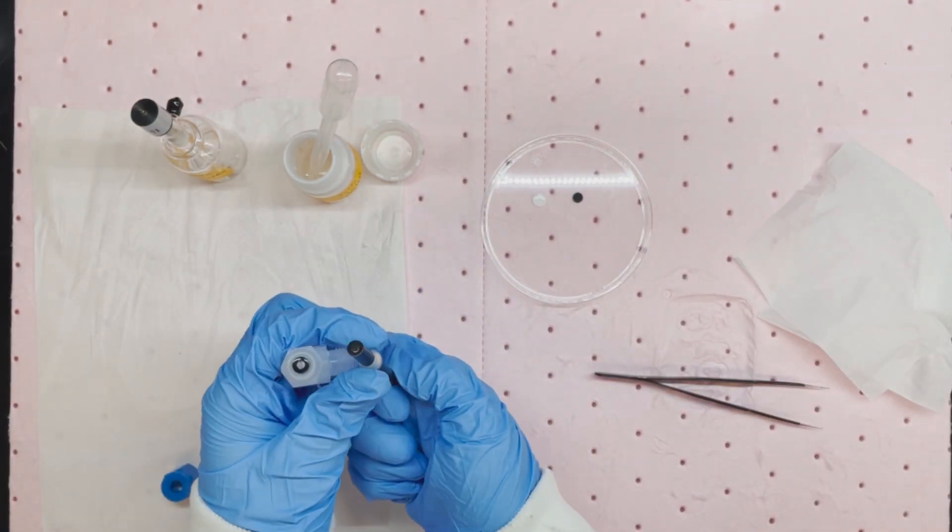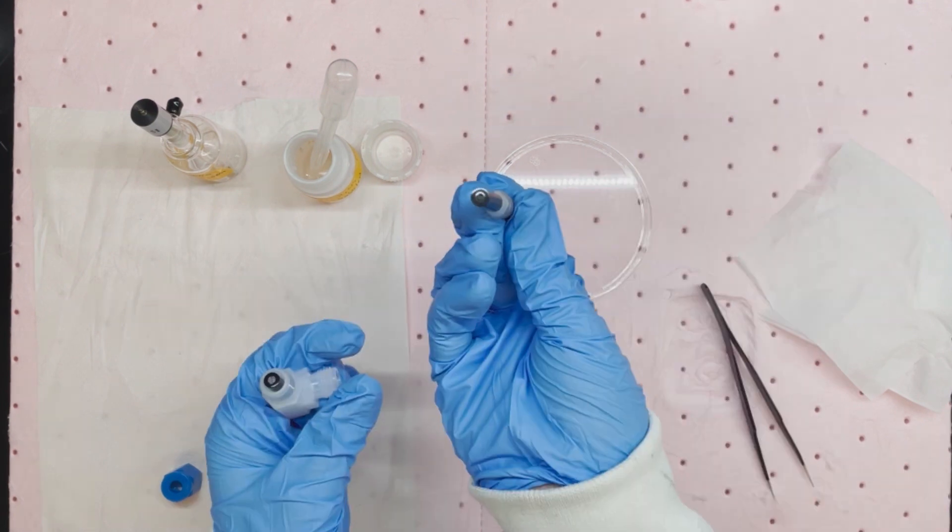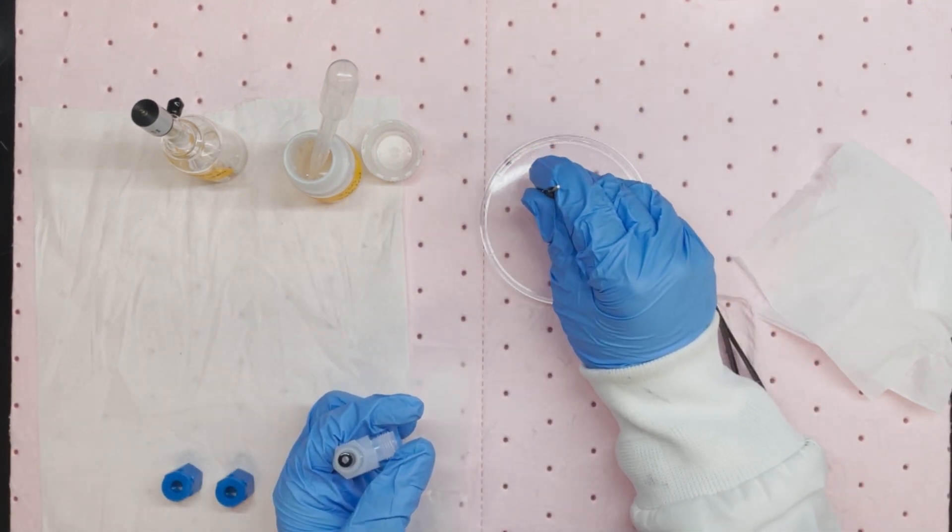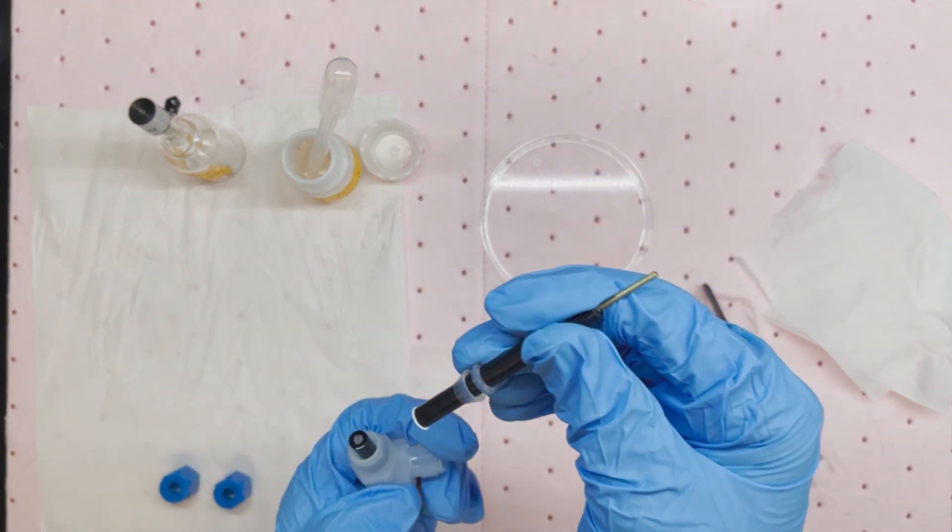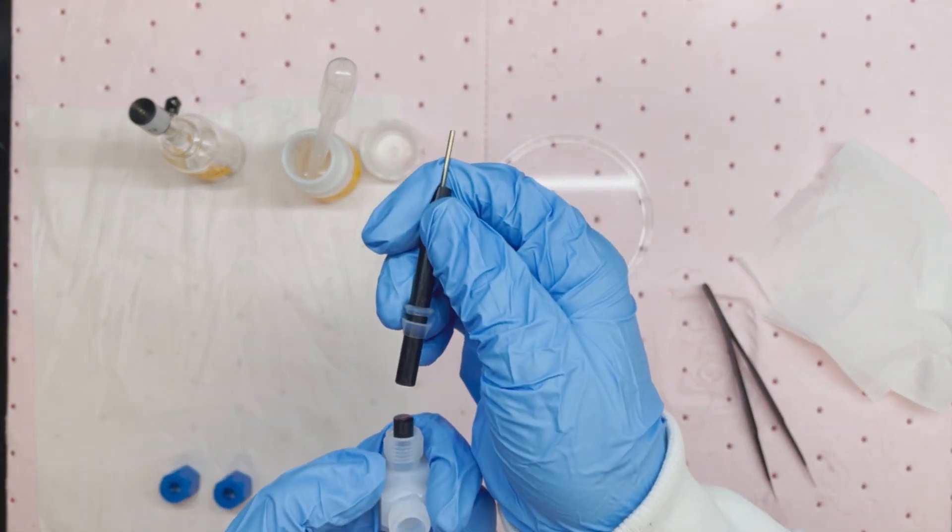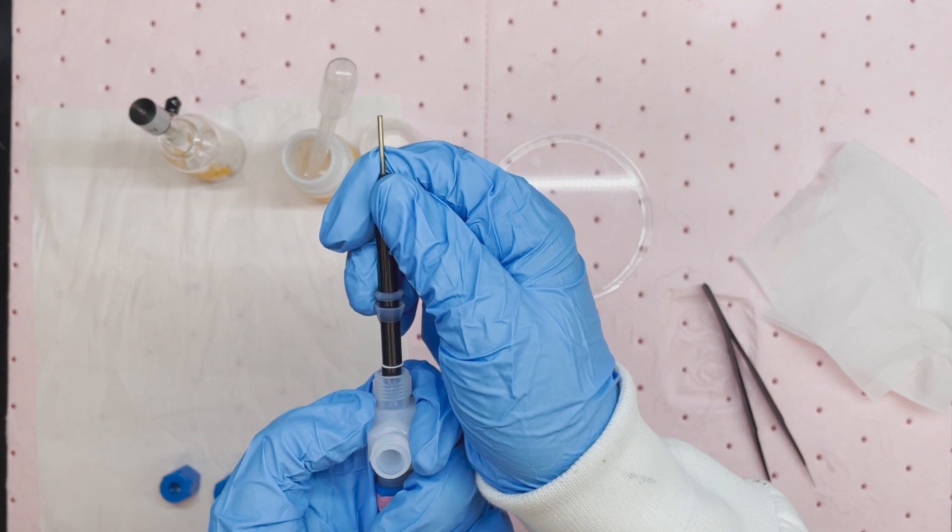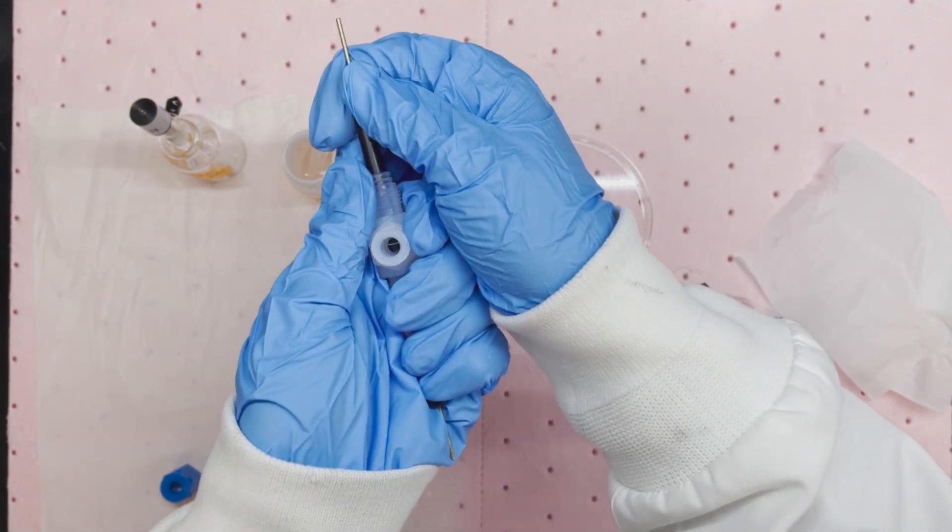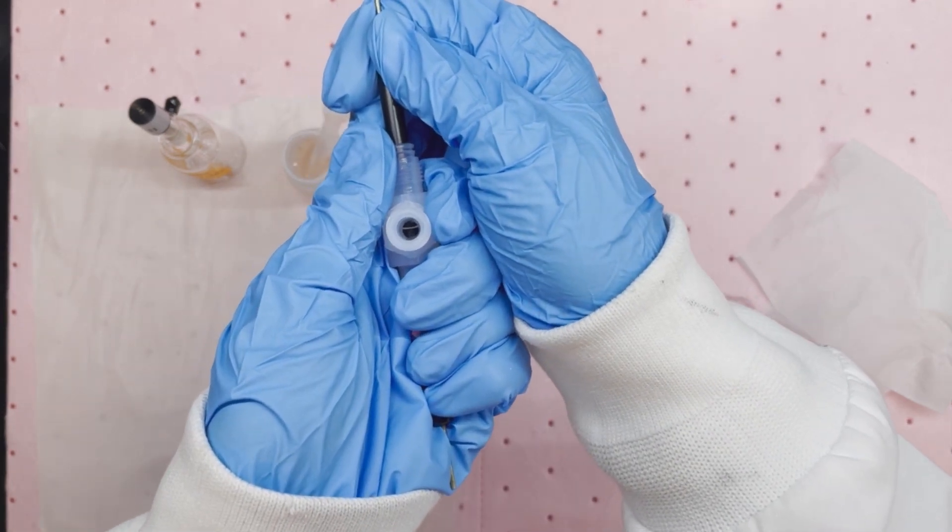To place the counter electrode and separators, we first assemble them and press the other glassy carbon electrode firmly against this assembly. They will stick. Make sure the two glassy carbon electrodes are aligned and press the counter electrode against the working electrode until they reach the center of the cell body.